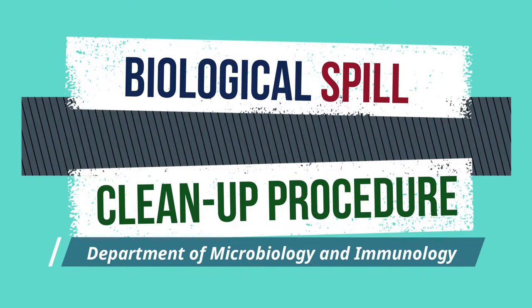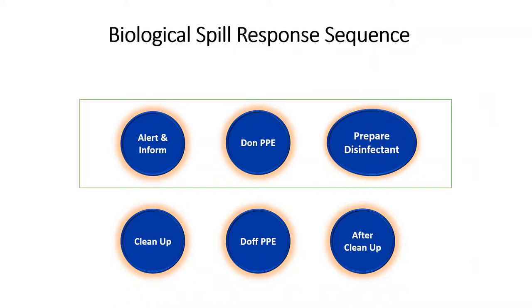Hello everyone, we are from the Department of Biological Safety Committee. Today's video will show you how to do a biological spill cleanup inside a laboratory.